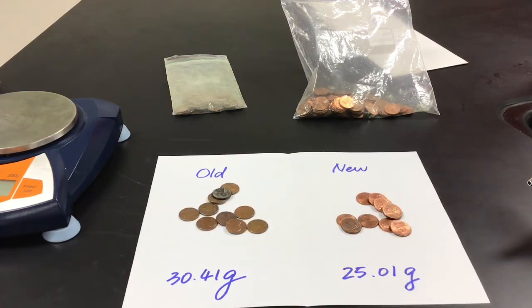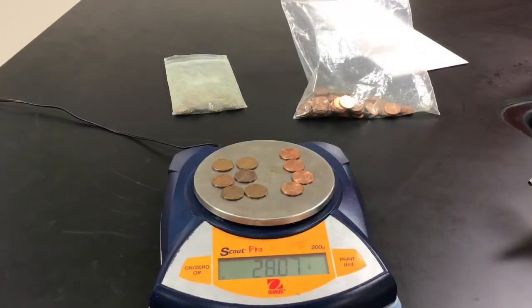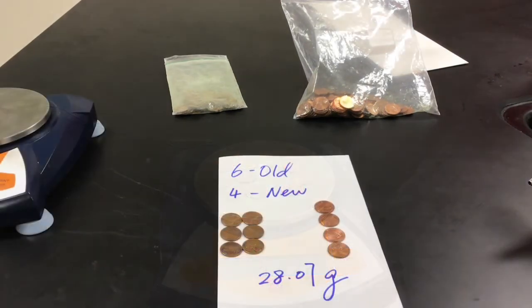Now, going to part B, you will still need the data from your part A to finish the number 2 calculation. After the calculation, I place 6 old pennies and 4 new pennies on the balance. It shows 28.07 grams. Here is the data you need to finish part B.